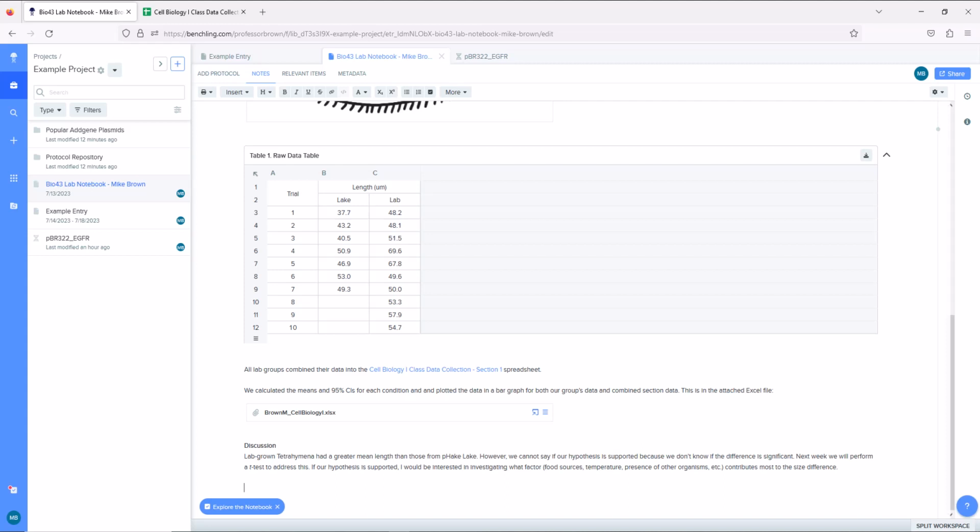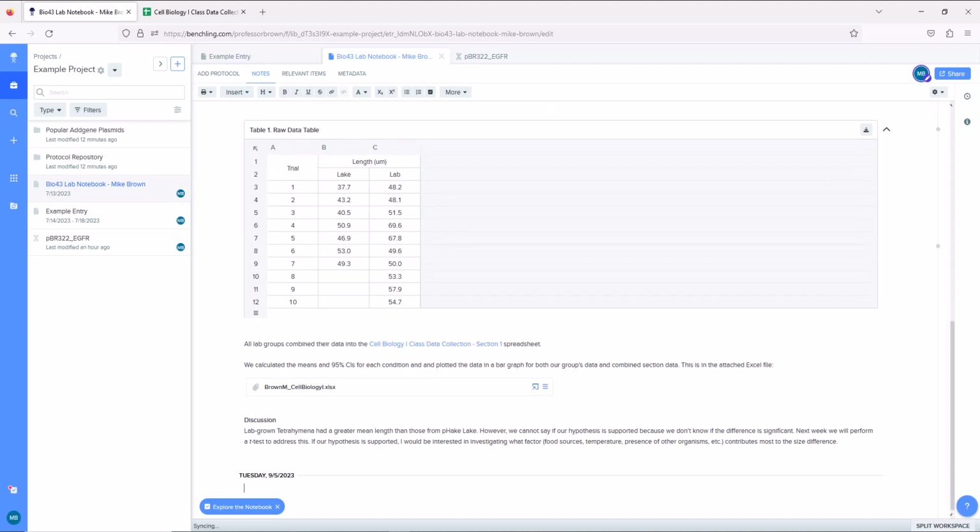Next time you have a lab with a notebook assignment, go to Insert and choose New Day. If the new day it adds doesn't have the correct date, you can click on the date and change it to the right one. Then you're ready to add your new entry. Finally, remember to follow all cleanup instructions, since that is also a part of your notebook grade.